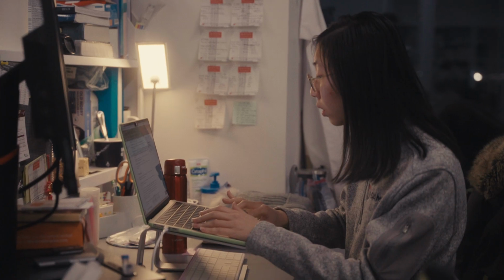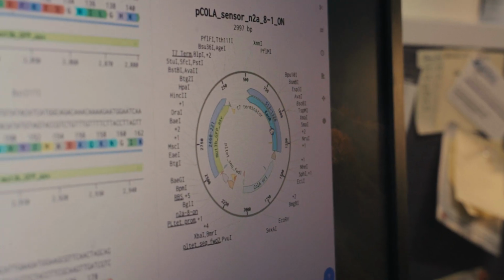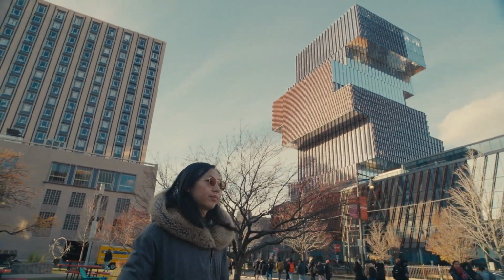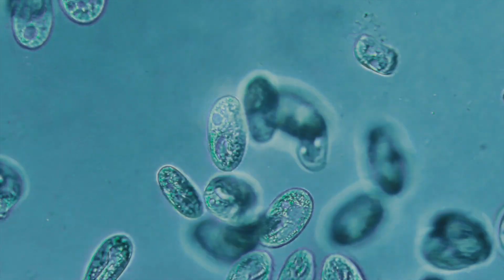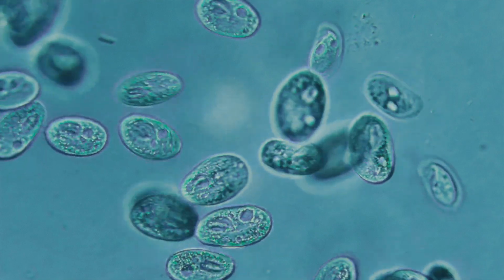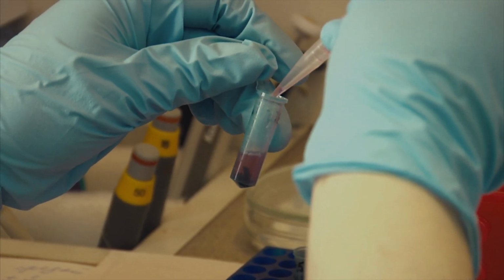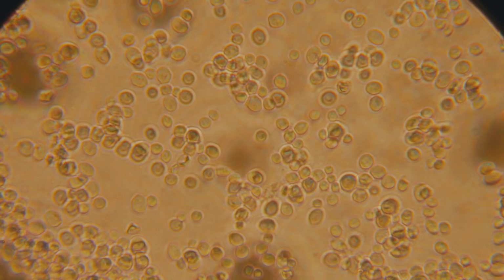When I was in college, my biology teacher mentioned to me for the first time the Human Genome Project. I knew I wanted to do something with engineering, and I ran into the DAMP lab. It's the first time I really heard the word synthetic biology. The first project I did was for a genetic circuit. Basically, you modify the bacteria genome so it will react like a biological circuit inside the bacteria. I changed the functionality of this organism, so it's very cool to me.